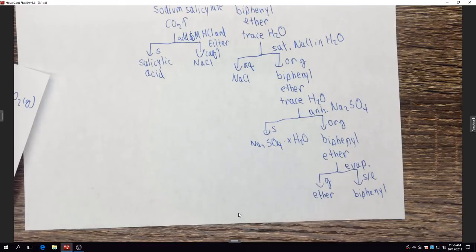All right, so to evaporate it as quickly as possible, we crank it up. So that is essentially what you're doing in order to accomplish this reaction. One tip I can give you is label everything. Okay, so if you pour some clear liquid from the separatory funnel into a beaker, just label on there, "This was, I'm on step 2, and this is the extraction." As best you can, label it.